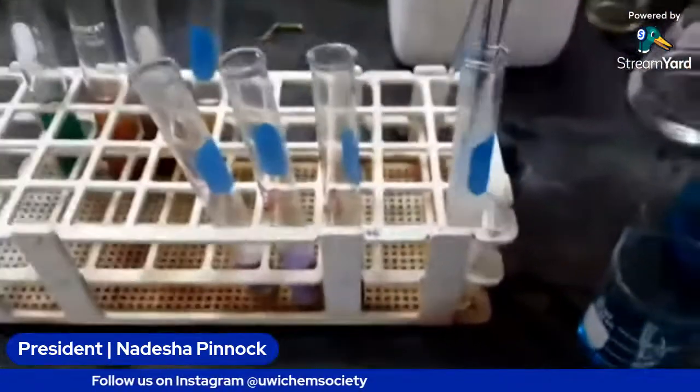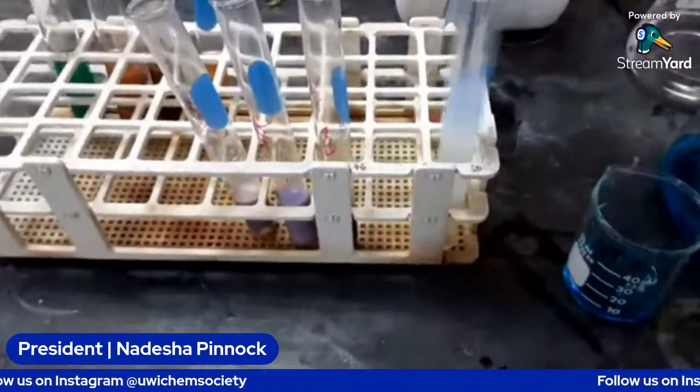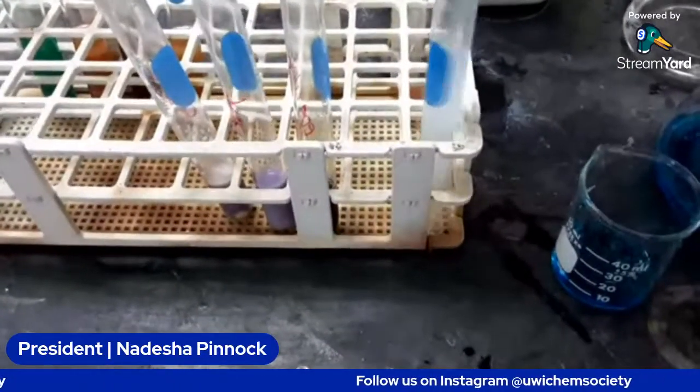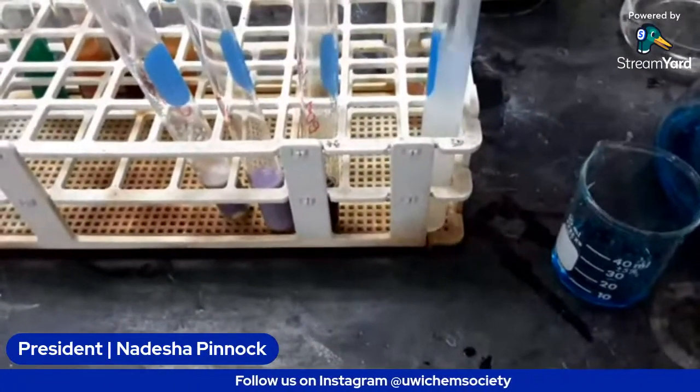Alright, so I'm going to try to use the stirring rod to mix the oil and the ethanol as much as possible.